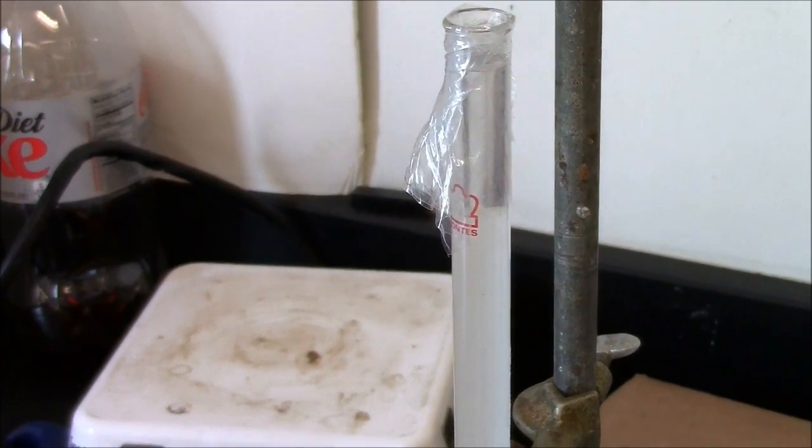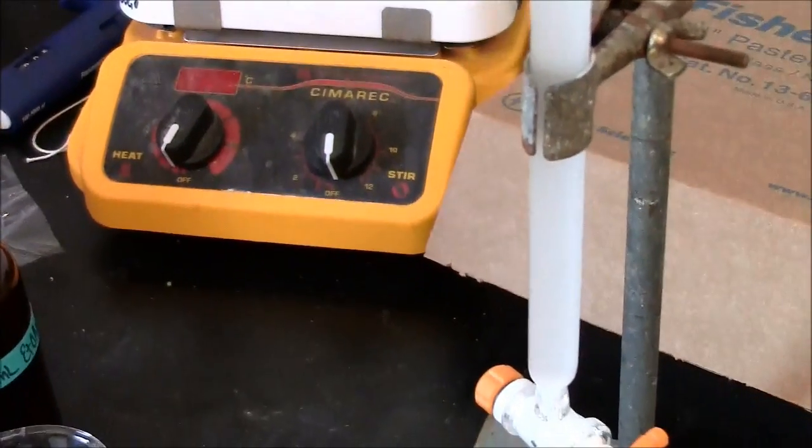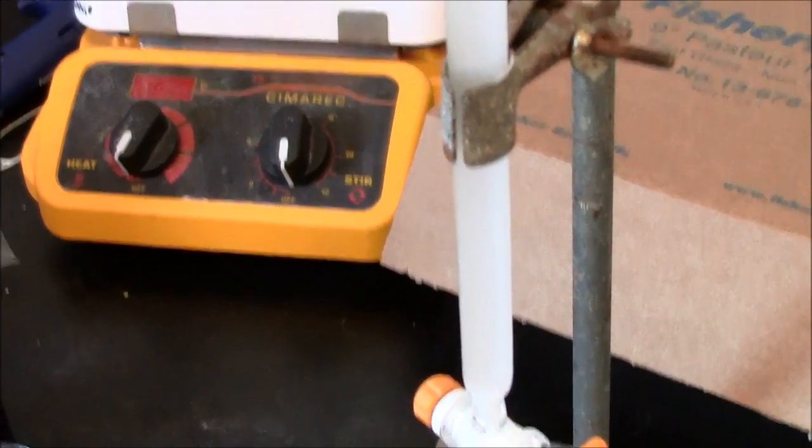Here's a close-up. We've got solvent on the top, nice smooth silica all the way down to the bottom. That's the way it should look.